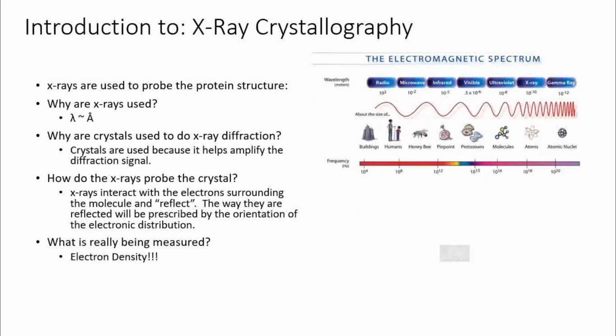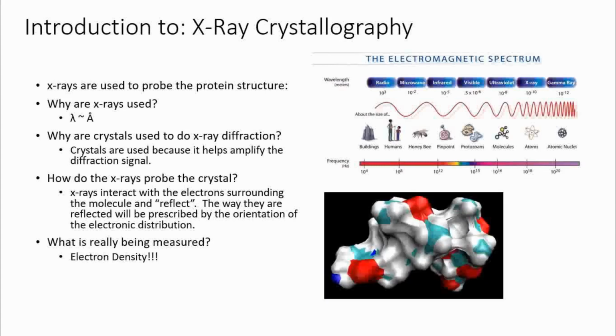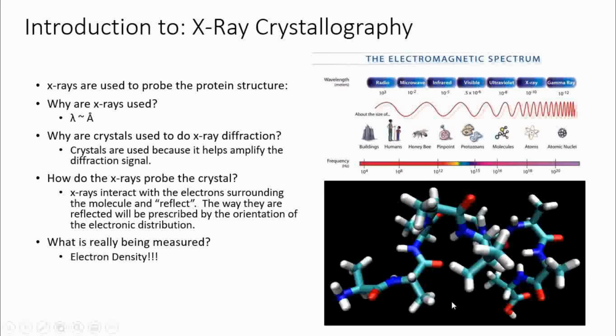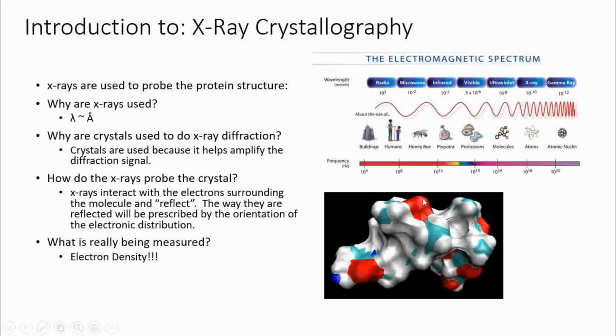But even if you see this structure we saw, it is not exactly the same as what you are seeing; you cannot draw it as a geometrical shape like this, but your actual protein is something like this. So when your structure becomes something like this, a lot of internal angles also come into play, which result in different angles of diffraction, which result in different intensities of the X-ray passing through them, right?